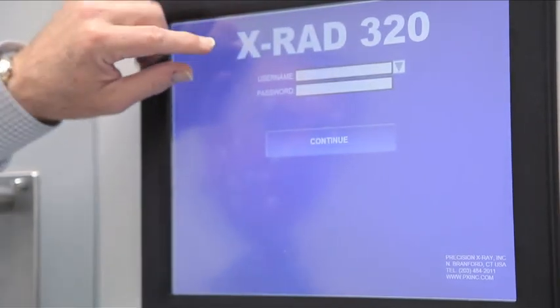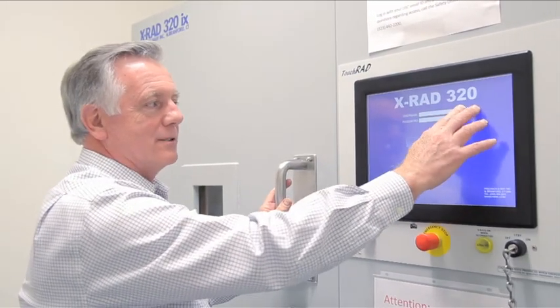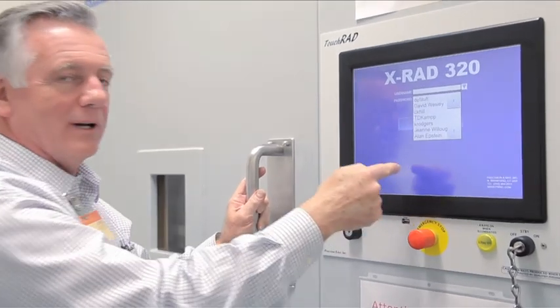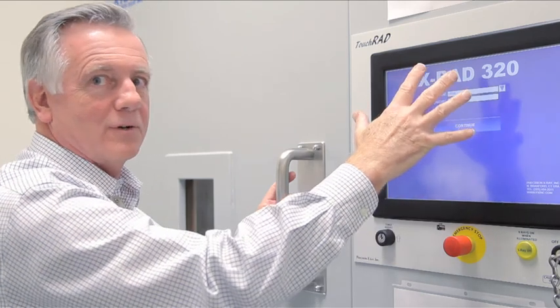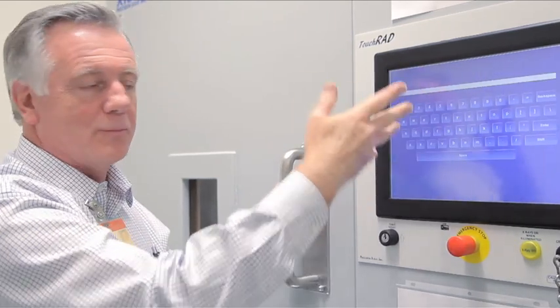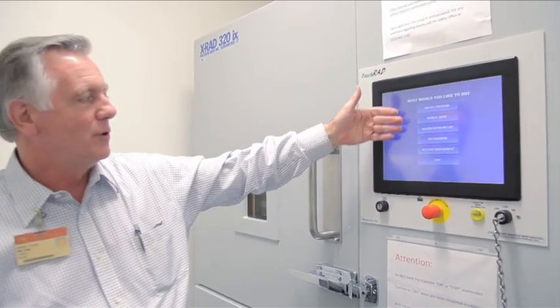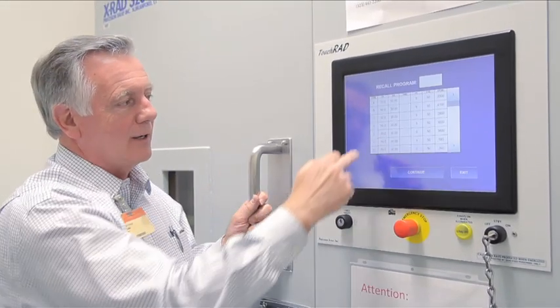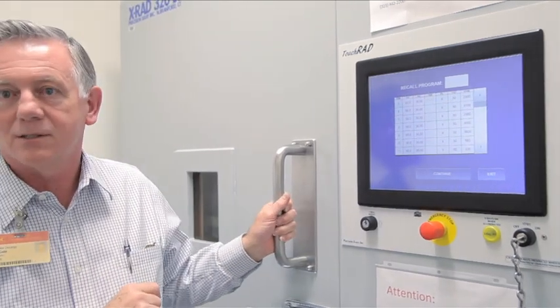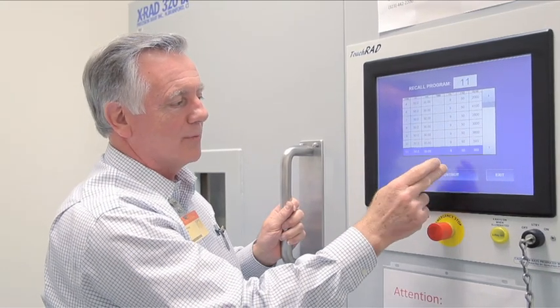Once initialization is complete, it comes up and asks you for a username and password. Usernames are already entered, so you press to bring up a list, find your name, and then enter your password. This is all touch screen. Once you've entered both, you press continue and that brings you to the program. If you are a standard user, you'll only have access to the recall program. You click on that and it will show you the programs you have access to. You pick the program you want to use and press continue.